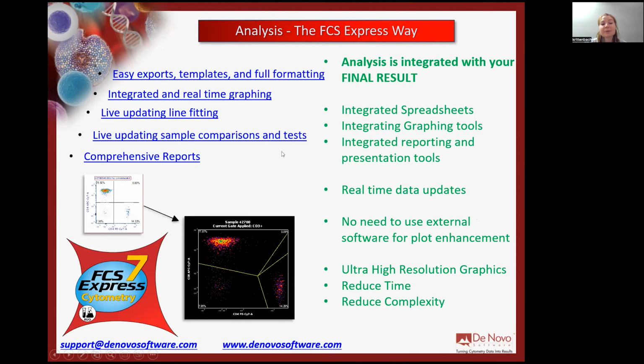So FCS Express has many features, but I'm just going to highlight a few of them here. You can do easy exporting into multiple different formats. You can use our integrated spreadsheet tools, integrated graphing tools, integrated reporting and presentation tools.